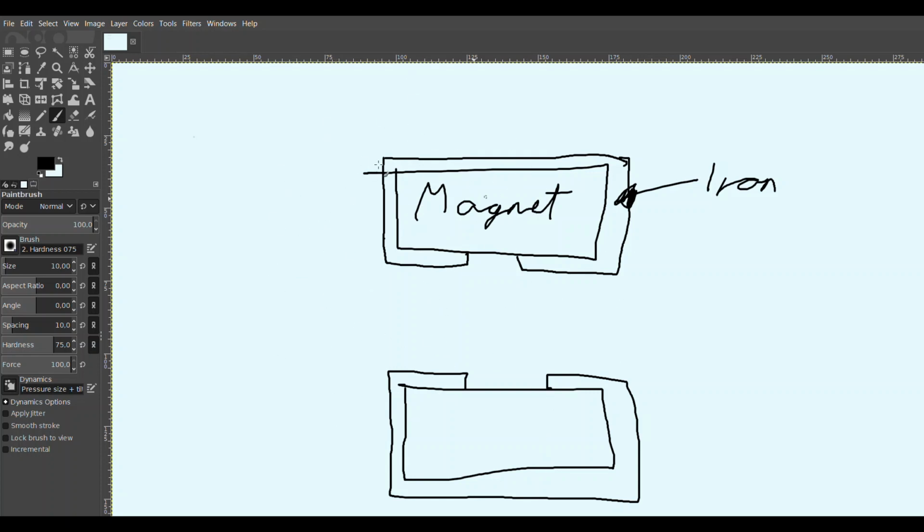So this surrounds the path of the electron beam. So this is torus shaped or donut shaped, if you wanted magnet donuts. Well, that does really not sound that tempting. So these are very powerful magnets. To the electrons, this more or less acts as optical lenses do to light.